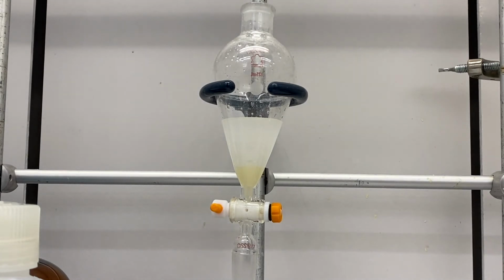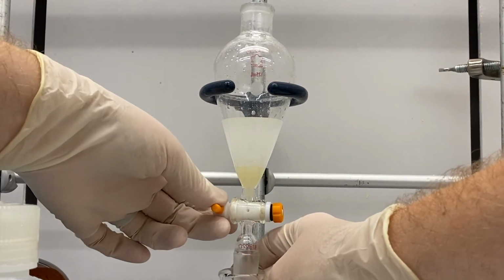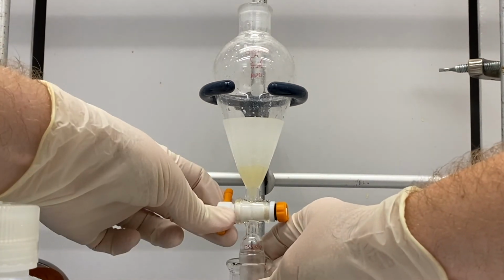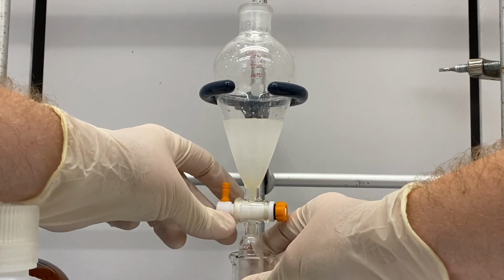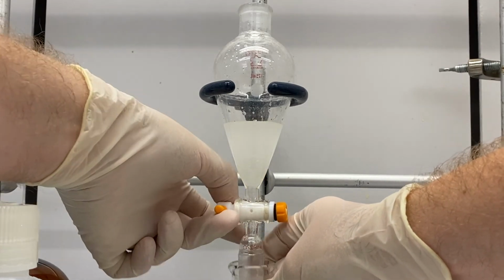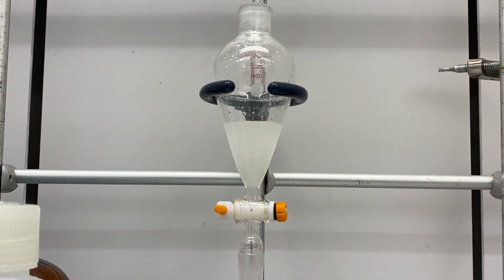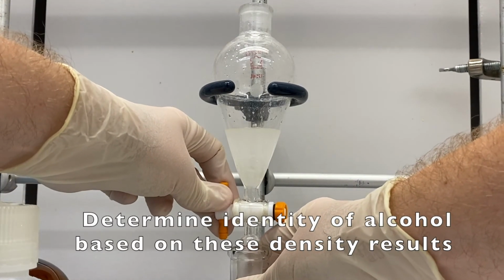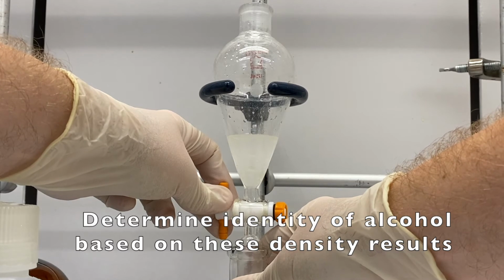Alright, so hopefully this is separated out enough. It's kind of hard to see, but that layer is right here. Okay, so we're going to drain that out. Alright, I took a little bit of the aqueous layer just to make sure I got all the organic stuff, because I'm going to put the organic back in.